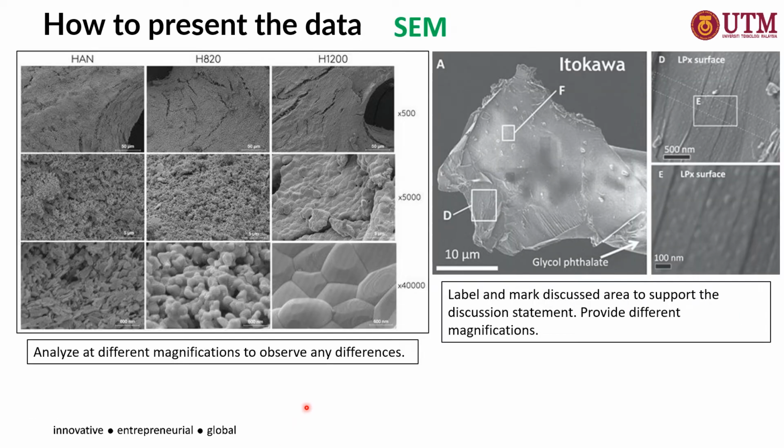Okay, next for the SEM. I will show how we can combine the EDX with SEM results. But not all samples require EDX analysis. For example, if you have too many samples and you want to study only using SEM, this is one example.